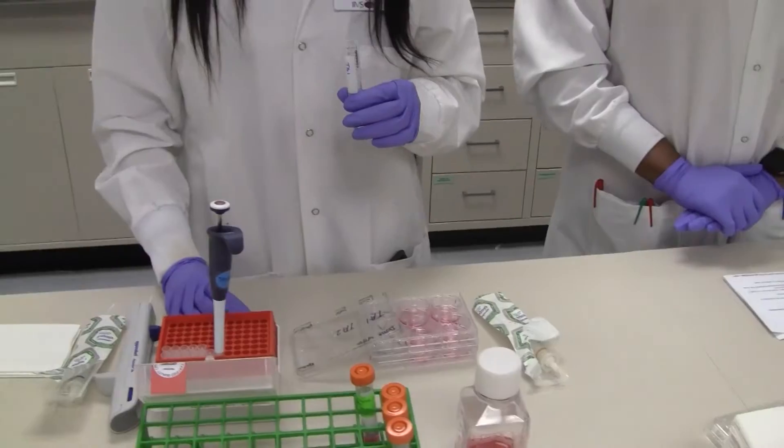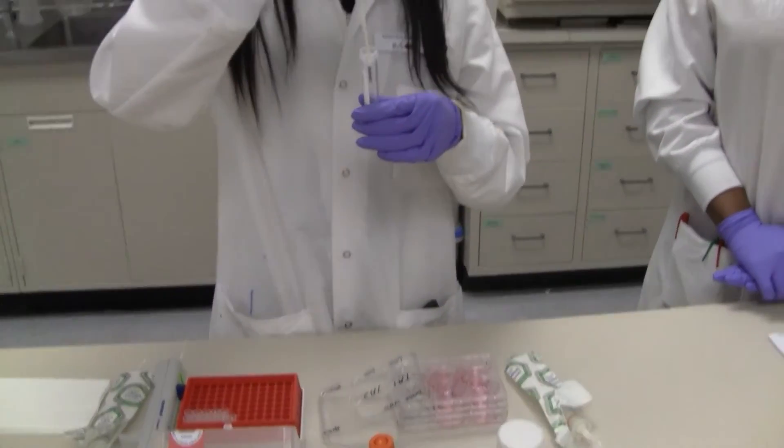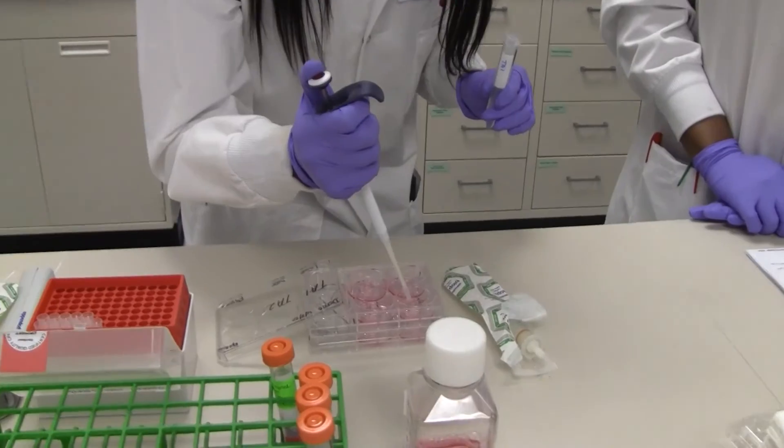While carefully dosing, we make sure that we are not touching the tissue so we don't cause any damage or tissue loss.